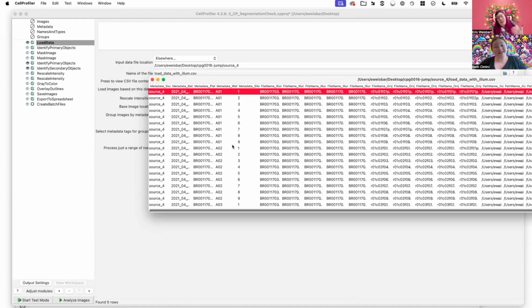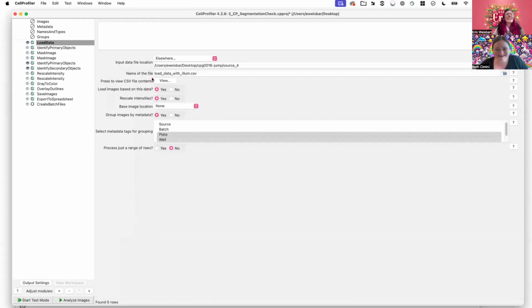Yes, it does. And here we go. Hooray! It looks like a spreadsheet. Hooray for spreadsheets.